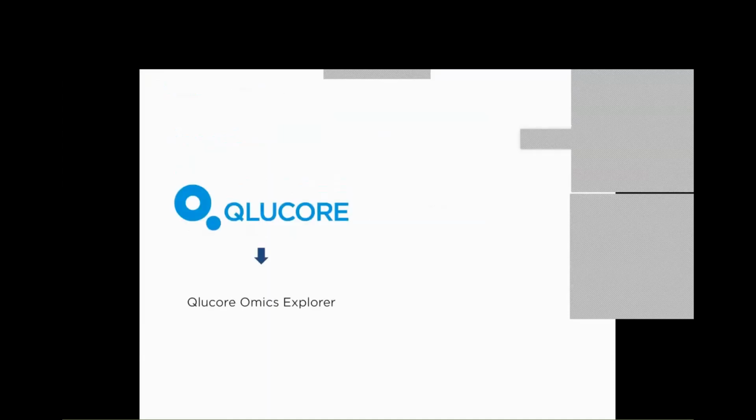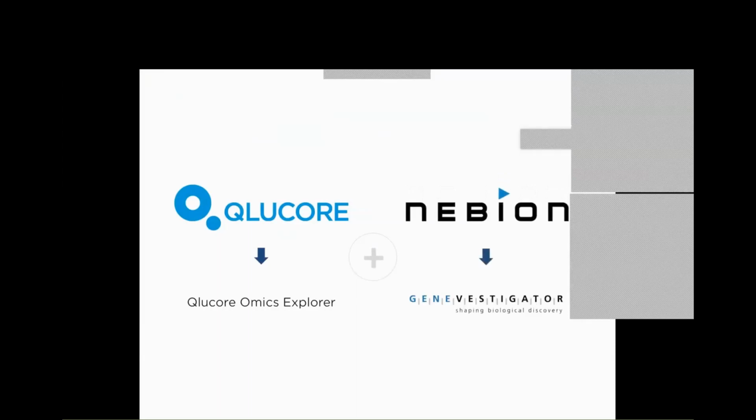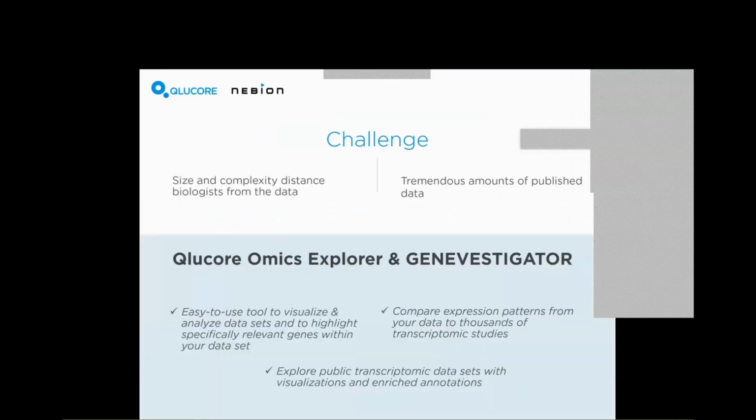Our two softwares are Qlucore Omics Explorer from Qlucore and Genevestigator from Nebion. The challenge that many scientists face is that the size and complexity of the data sets really makes it hard for biologists to understand the data.